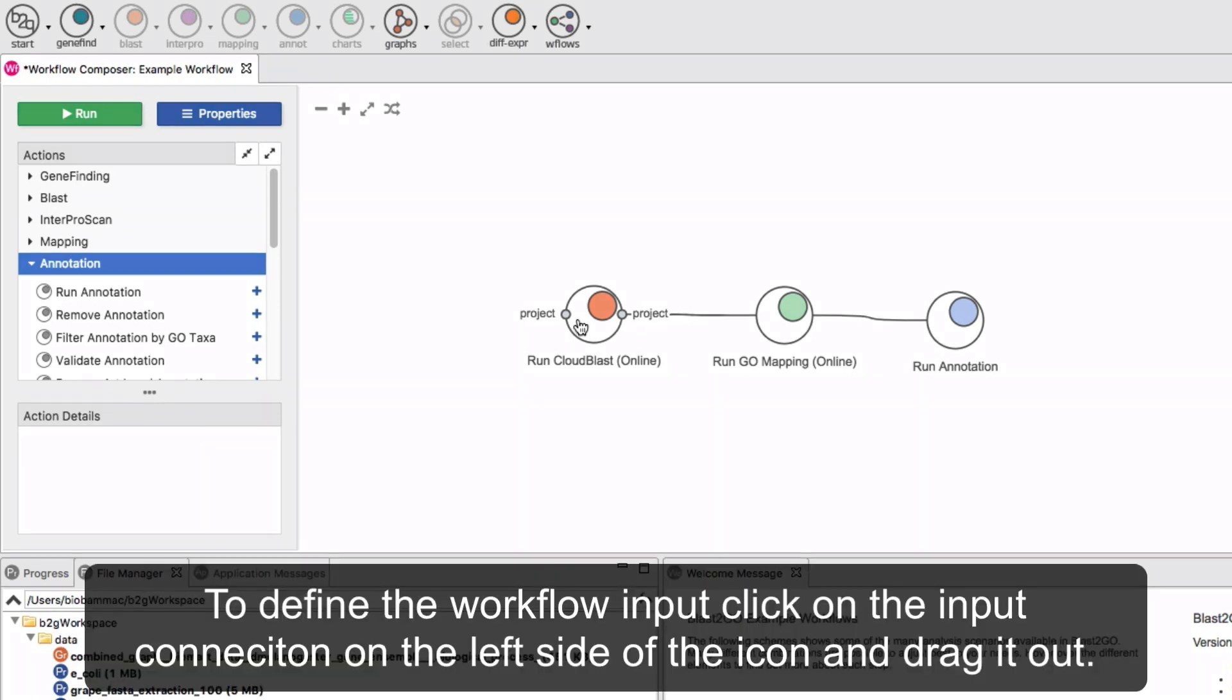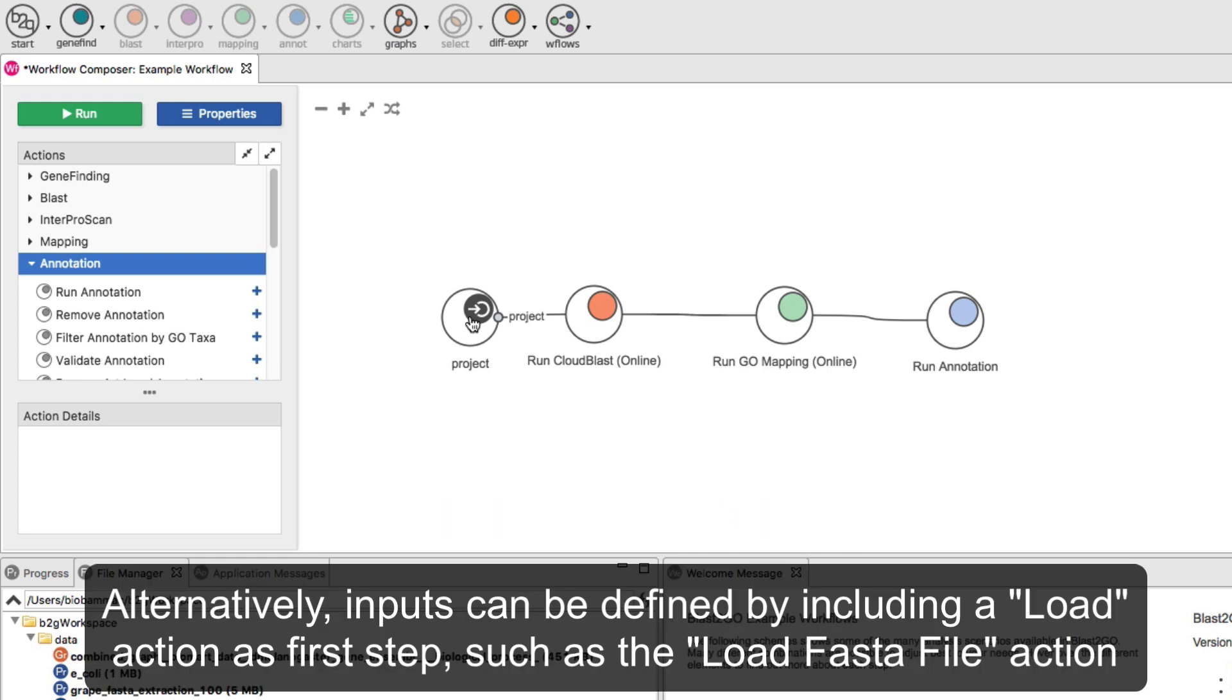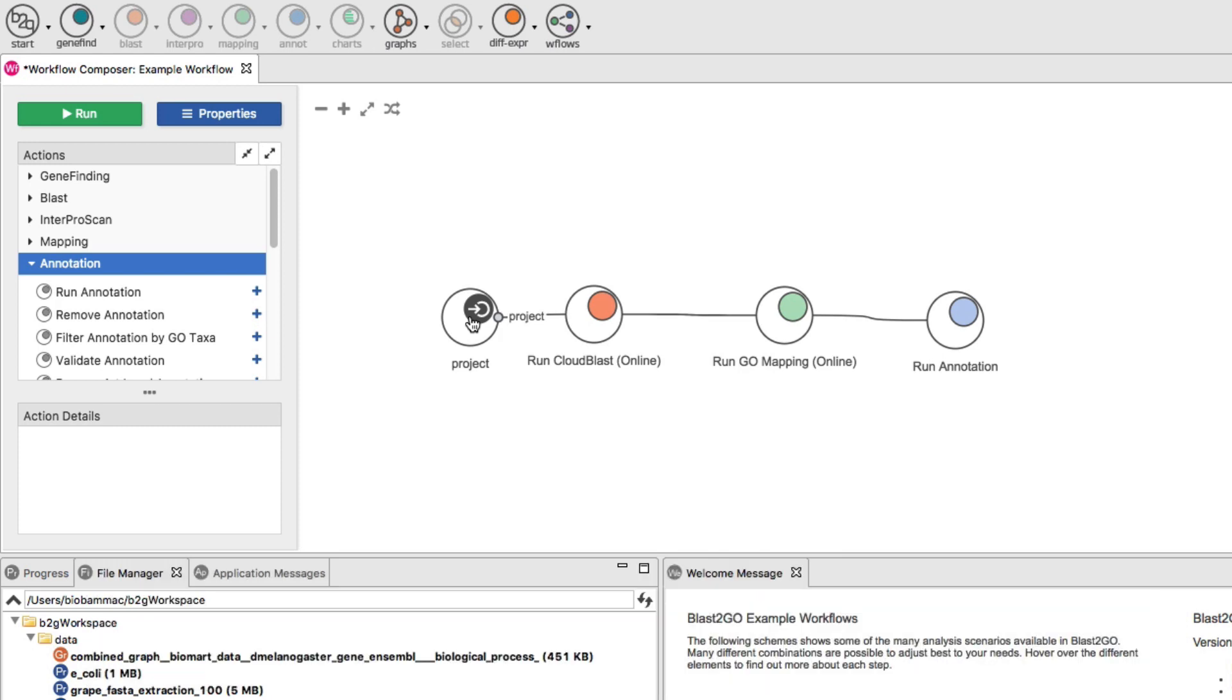To define the workflow input, click on the input connection on the left side of the icon and drag it out. Alternatively, inputs can be defined by including a load action as first step, such as the load FASTA file action.